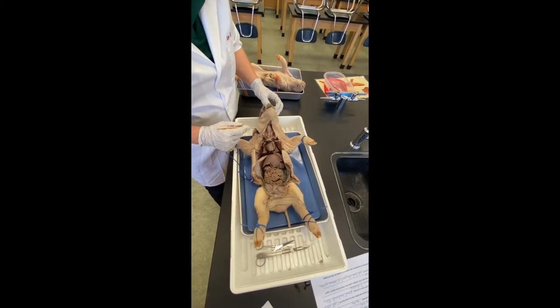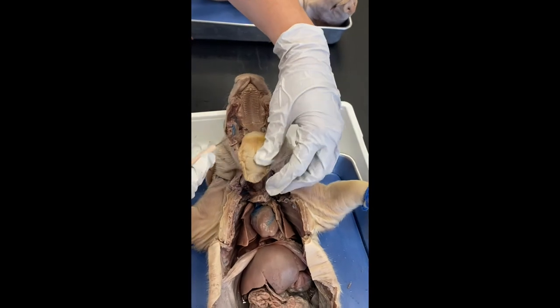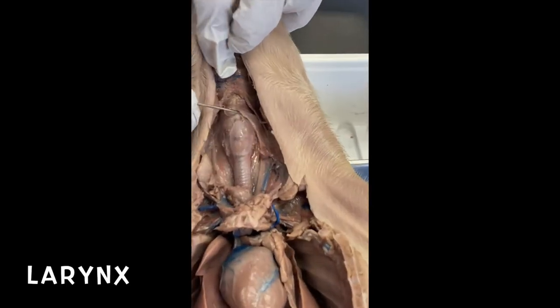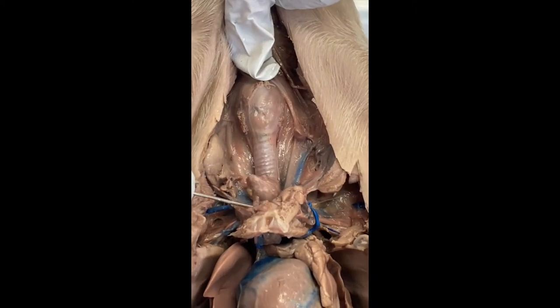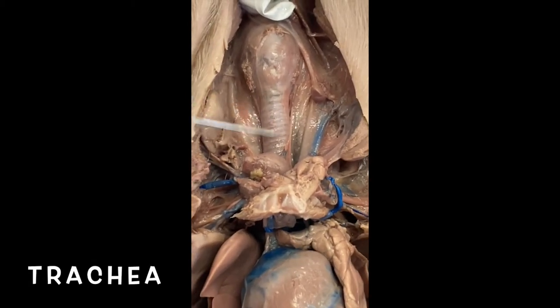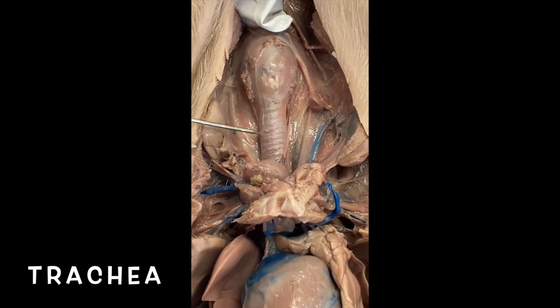All right. To go ahead and show you guys the trachea and the esophagus, since we were talking about the beginning of digestion with food going down the mouth. Here, so this is like the Adam's apple. Here's your larynx, voice box, which is here. And then coming right off of it, you can tell that this, and when I rub the pen across it, it's ribbed. And you can see these little white cartilage rings.